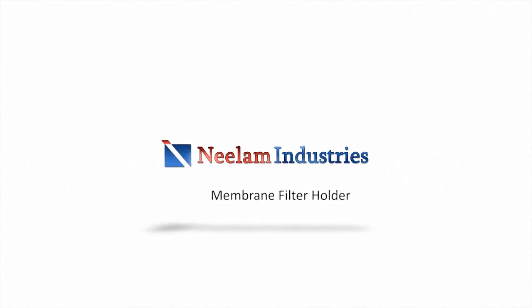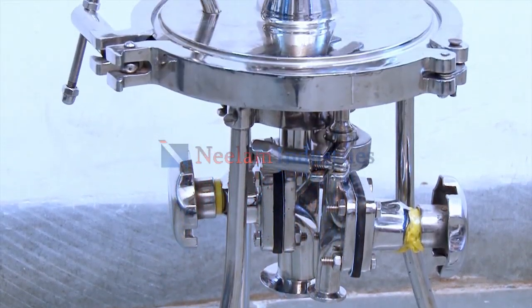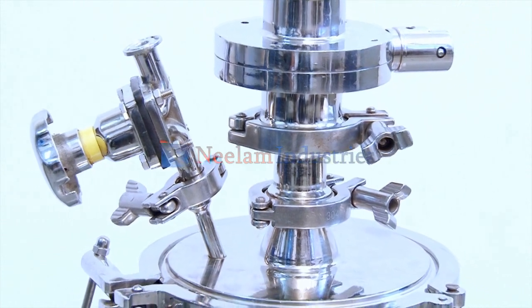Membrane Filter Holder is used for filtration of sterile liquid in pharmaceutical injectable plant, biopharma, vaccine, sterile bulk drug, R&D, etc.